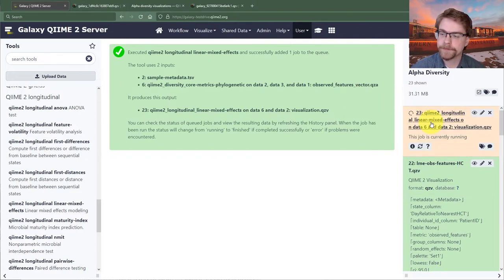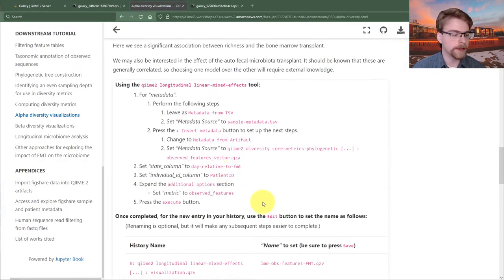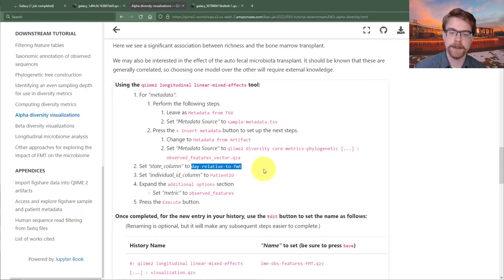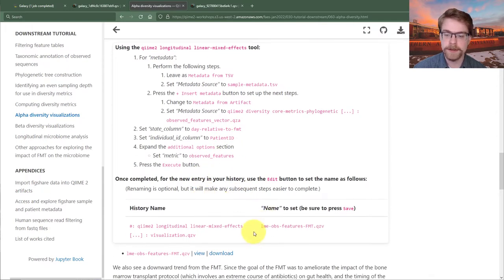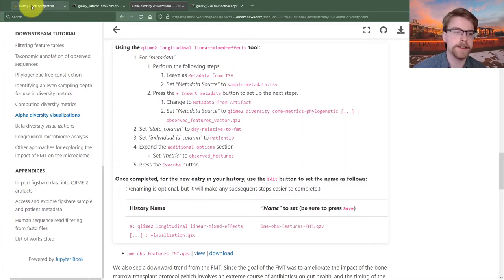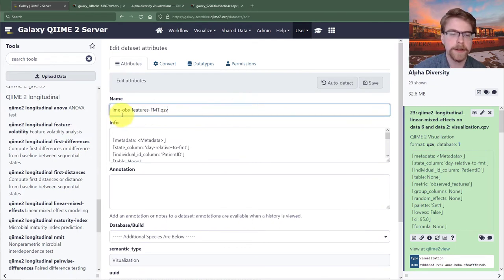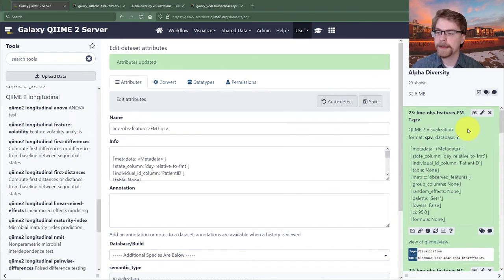I'll give that a minute to run. Going back to the instructions: we use sample metadata, observed features also as metadata from an artifact, set the state column to day relative to FMT, and the metric is observed features. The job finished, so I'll copy the name 'LME observed features FMT' to keep track of how it differs from the HCT version. I'll edit the just-finished artifact and rename it 'LME observed features FMT', then save.